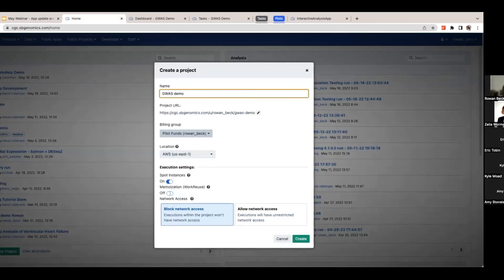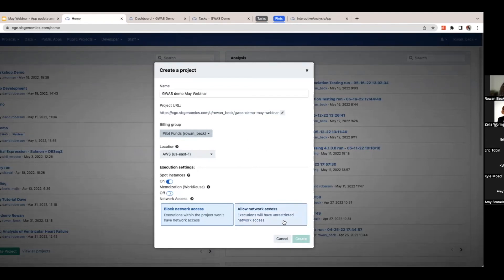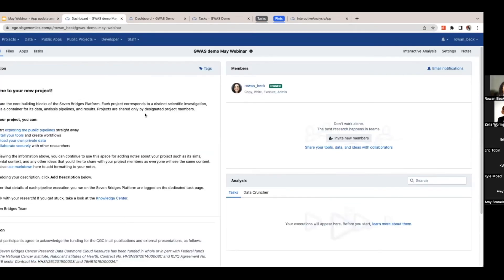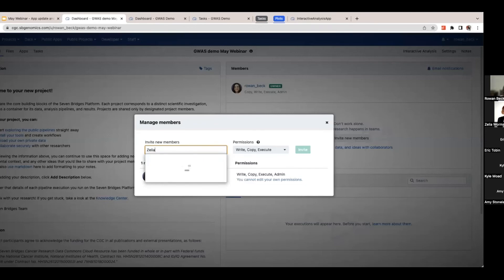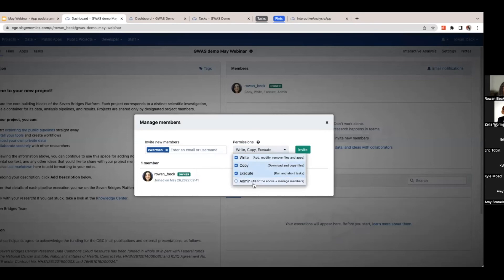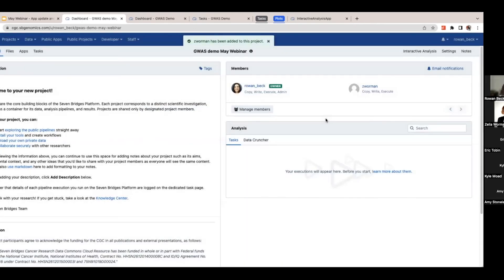Adding members is as easy as clicking this and then typing in the person's name. I'll add Celia here and I can change the permissions — she can write, copy, execute, or I can make her an admin. This is also a great teaching tool: you can allow students to copy projects or files over without actually modifying anything in the project.